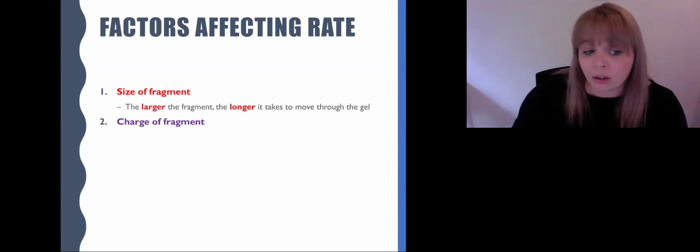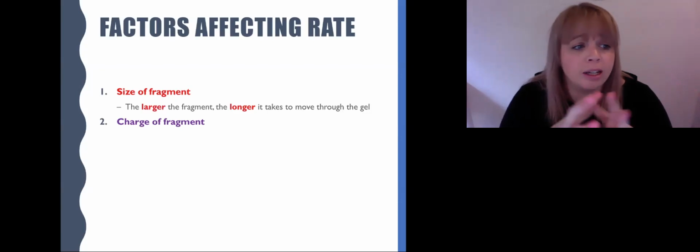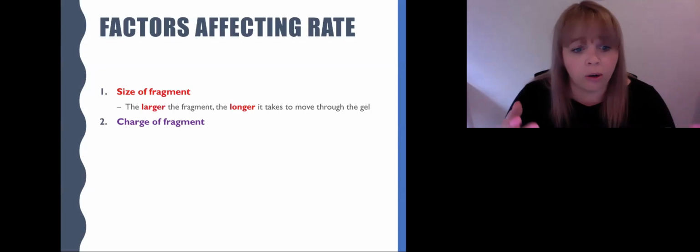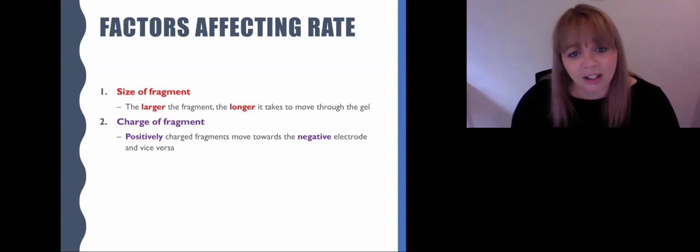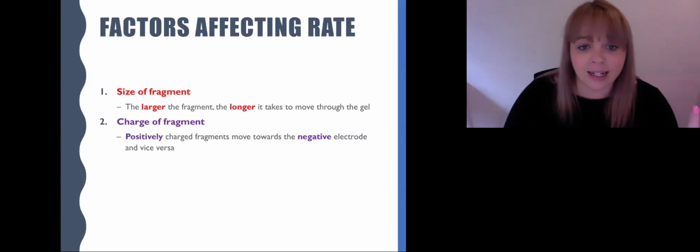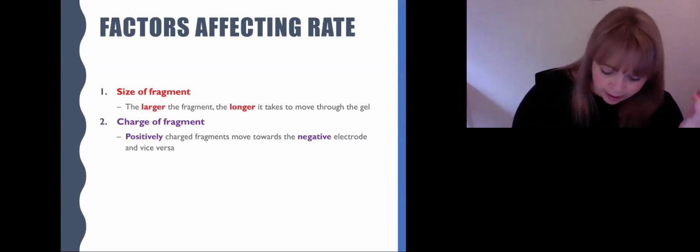So the second thing we're going to talk about is the charge on the fragment. I want you to think about if you're positive or if you're negatively charged, which way are you going to move? Positively charged fragments are going to move towards the negative electrode. For example, we don't do this with DNA. DNA is the other way around.